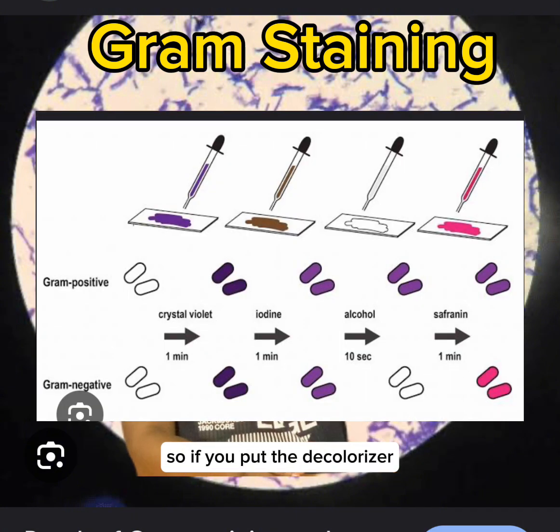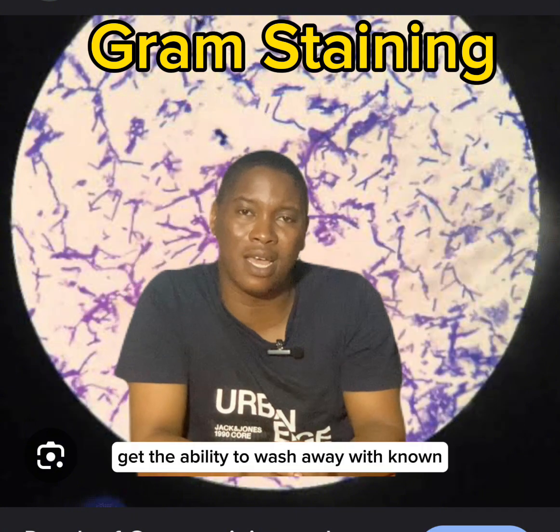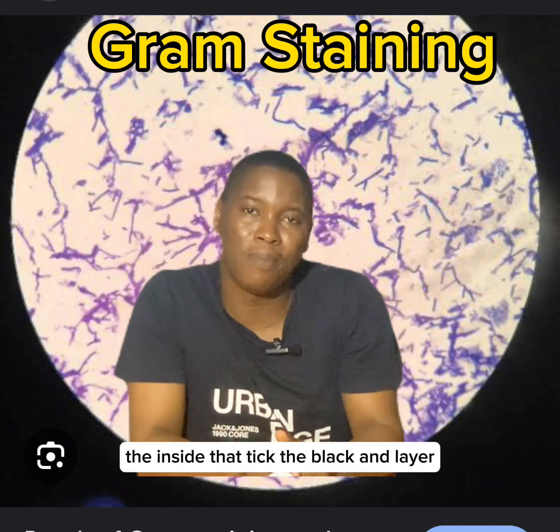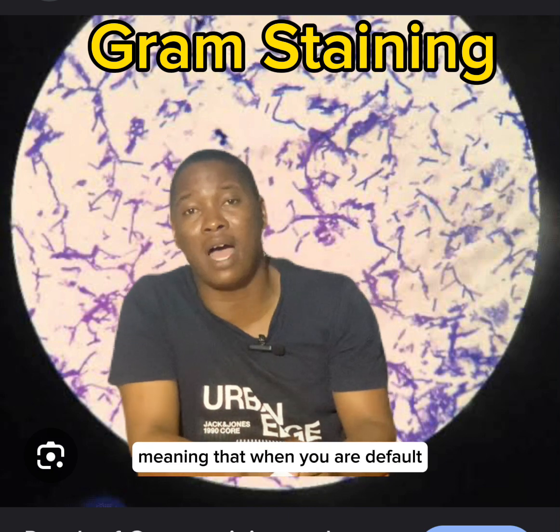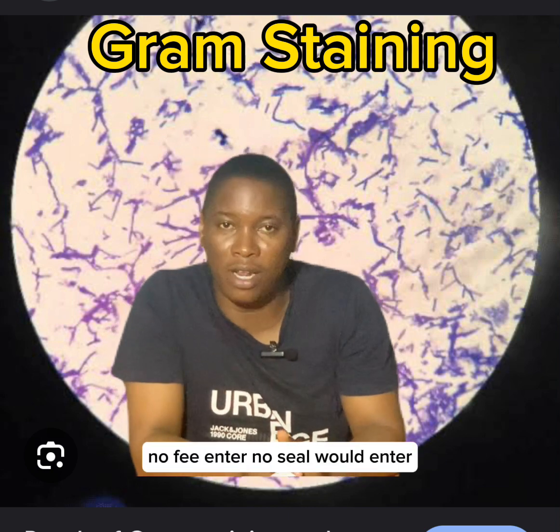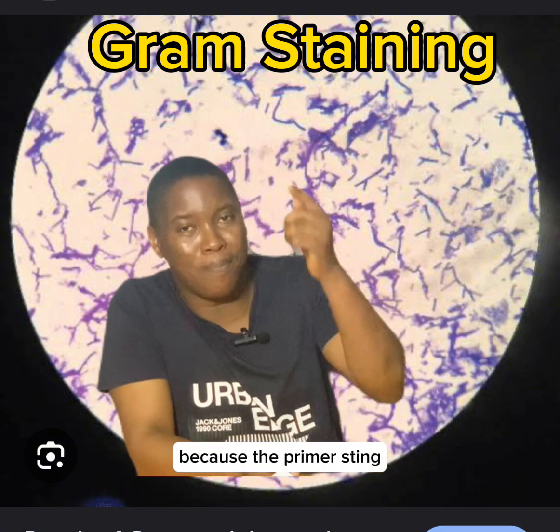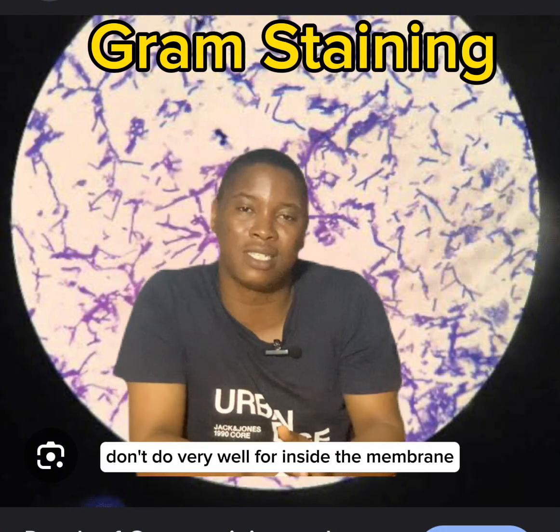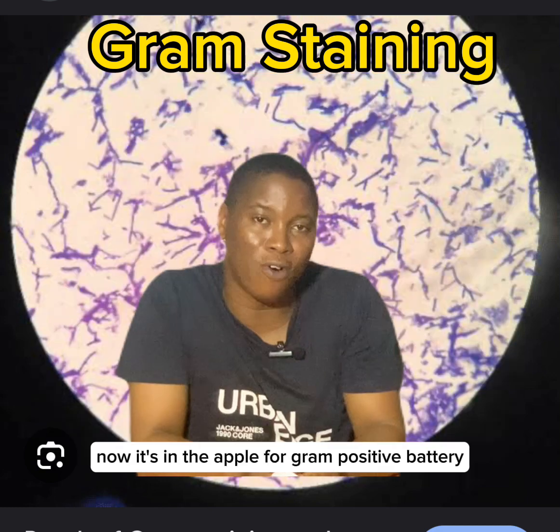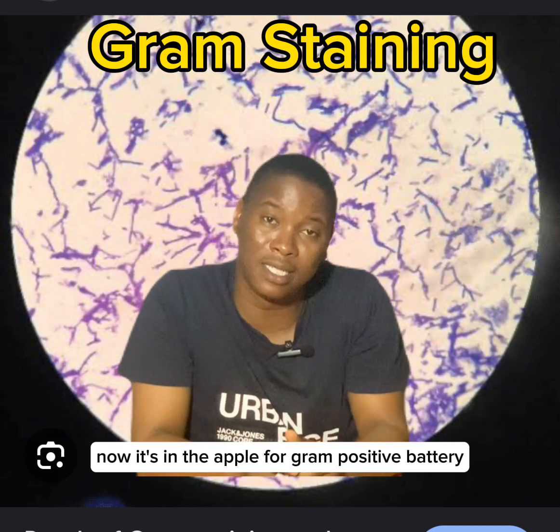So if you put the decolorizer no go get the ability to wash away wetin don dey inside that thick peptidoglycan layer, meaning that when you add the fourth chemical wey be safranin, e no go fit enter, e no go see road enter, because the primary stain don dey very well for inside that membrane, because the membrane dey thick. This one na wetin dey happen for gram positive bacteria.